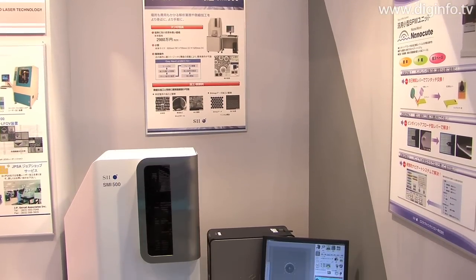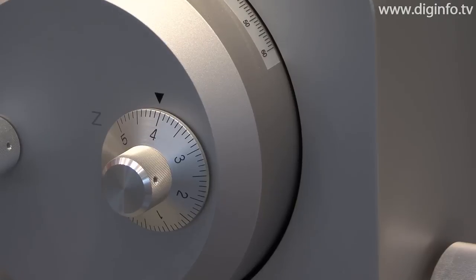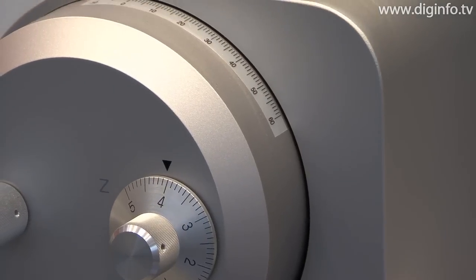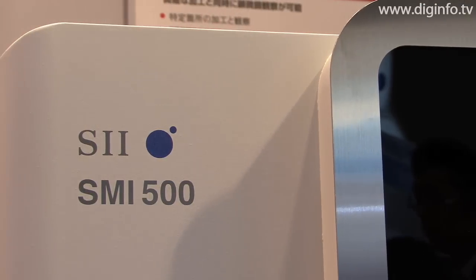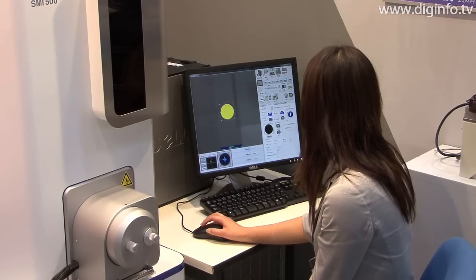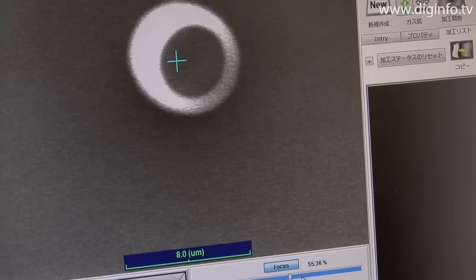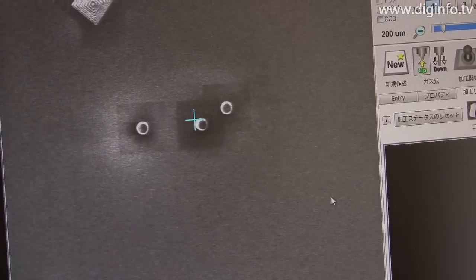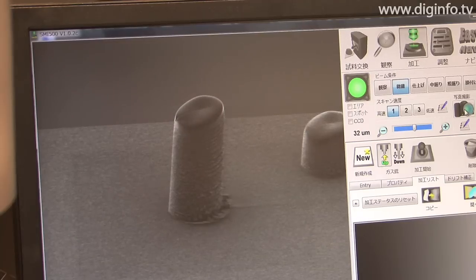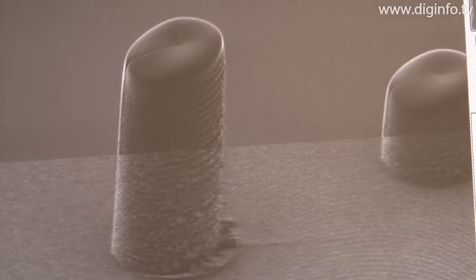HAKUTO exhibited the SMI-500 microscope system for nanofabrication, a new focused ion beam device from SII Nanotechnology at the 2009 MicroMachine MEMS exhibition. A focused ion beam device scans the surface of a sample using an ion beam narrowly focused to several nanometers. With this type of device, microscopic observation on a nano level, etching, and deposition can be implemented with a single device.